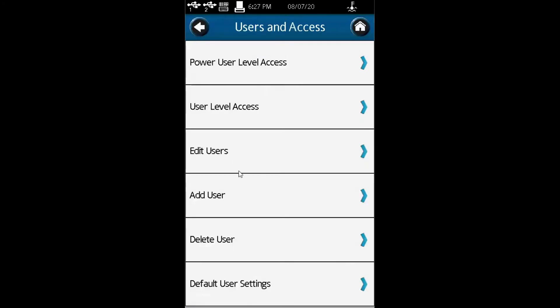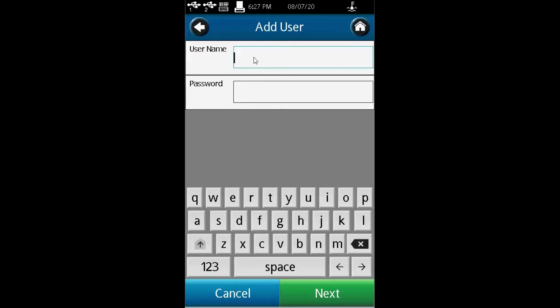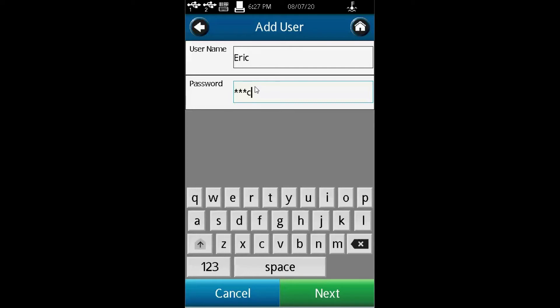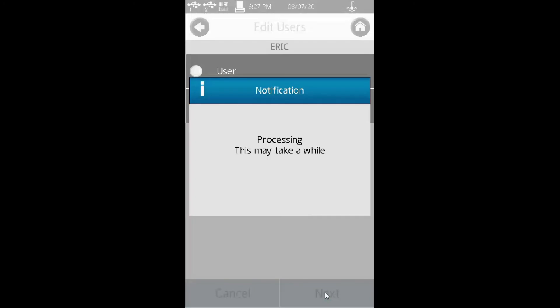You can also add users. For example, if I add my name, Eric, and use a password called Eric. Since I did not set password intensity requirements, I can use anything. Hit next. As you can see, Eric can be a user or power user. I'll set him as a power user and hit next.